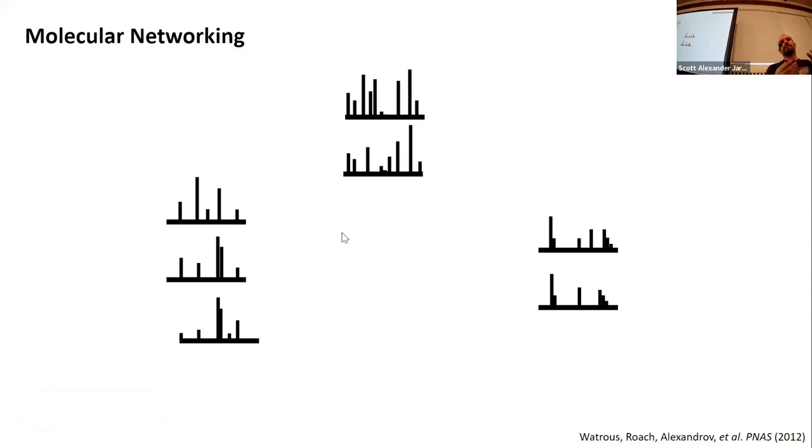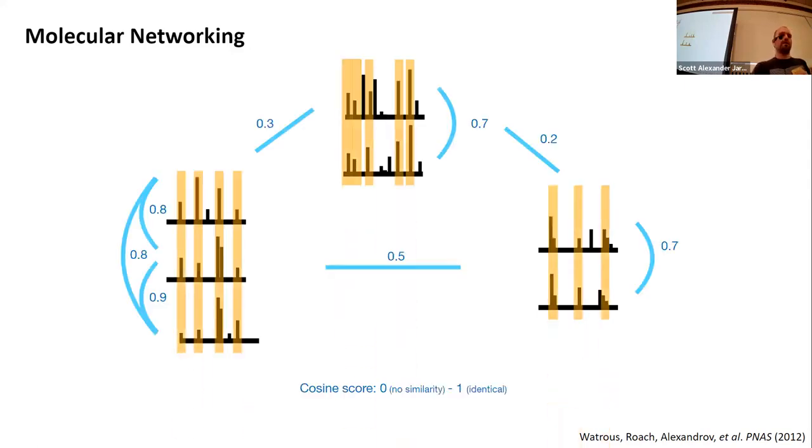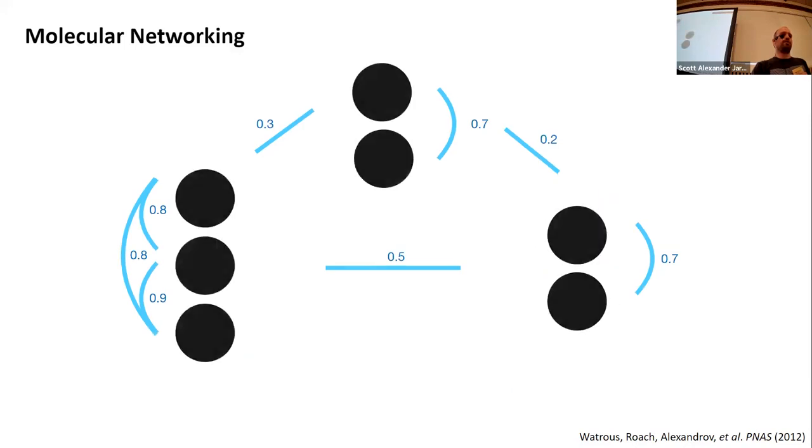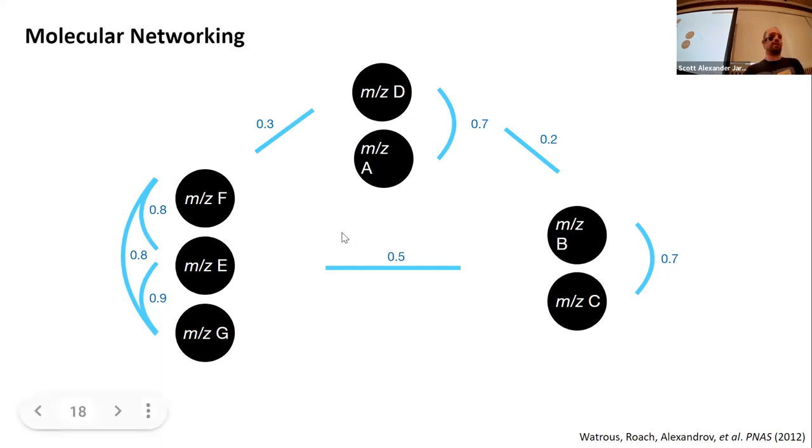If the score is above a certain threshold that you define in the job you just submitted, which by default for us was 0.7, then we establish links between those spectra and display them as nodes in these molecular networks. Part of the annotation is that we also match the spectra against the spectral library. You did this also in MZmine yesterday, and now GNPS is doing it too.